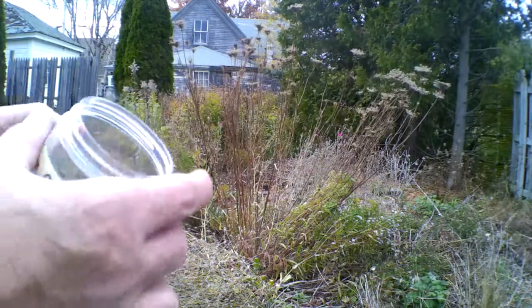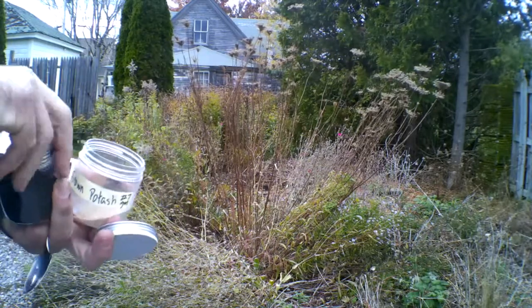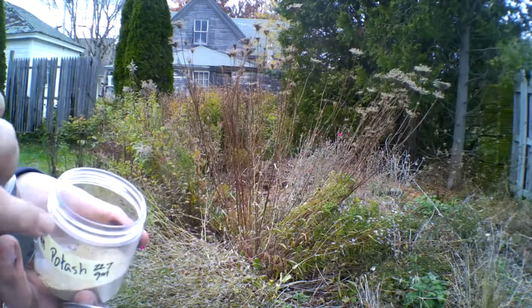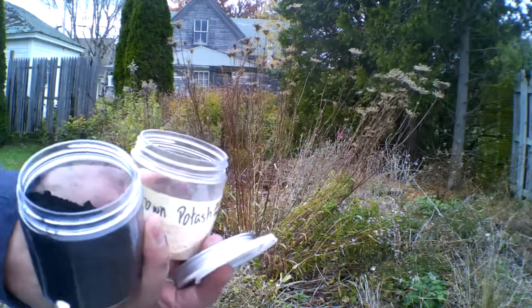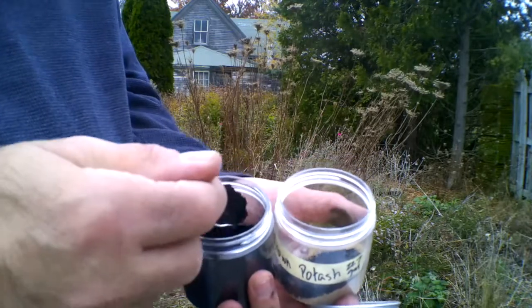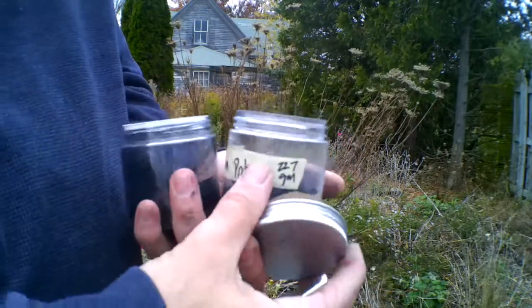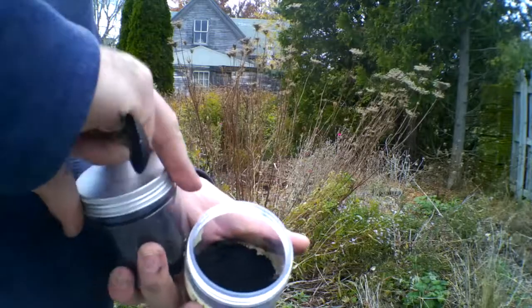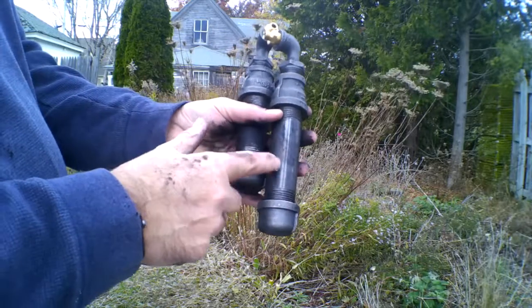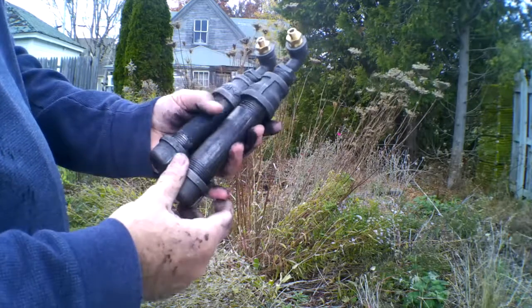So here we are back at the scene of the crime with my brown potash. I've already mixed my white potash with carbon in the upcoming attempt to essentially smelt, reduce potash to produce potassium. I'm out of charcoal dust, but I do have my activated charcoal, and it is just carbon, so let's put it in excess of that. We'll mix it up, and then we'll drop this stuff all into retorts and give it a smelt and see what happens. White potash, about 42 grams with an excess of carbon. Brown potash, 22 grams with an excess of carbon.